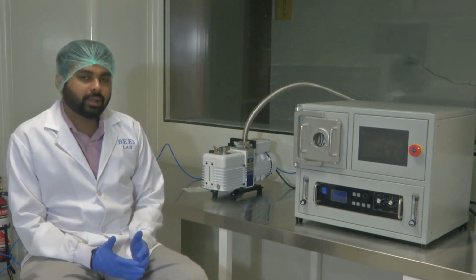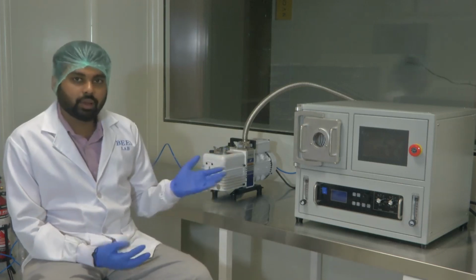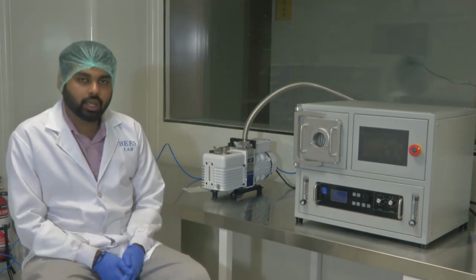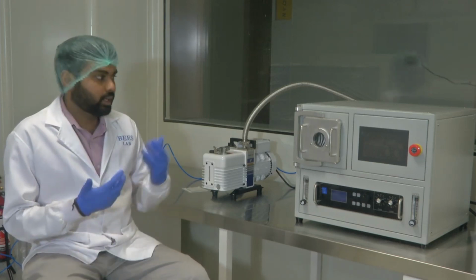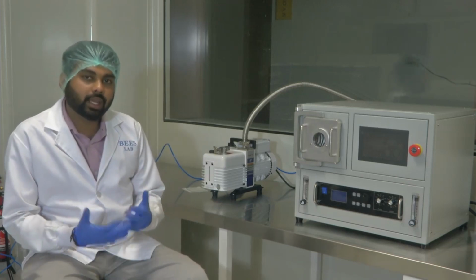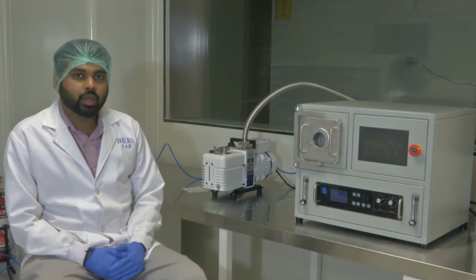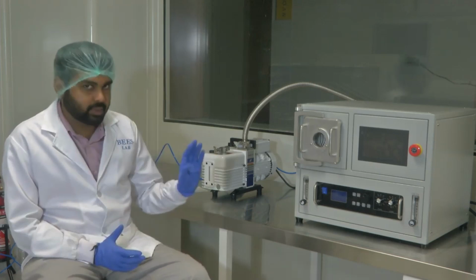That is how fundamentally throughout history new systems have been developed. This oxygen plasma has become a system like this after the pain and brainstorming of a lot of scientists and technicians. Everyone has contributed. Technicians contribute to how easily they are able to use an equipment, how intuitive the controls are. A scientist would give feedback on how you can improve the system, its range of operation, and its versatility of operation in what all fields you can apply. So this is how systems get developed. That's the overall idea about the plasma system, correct?